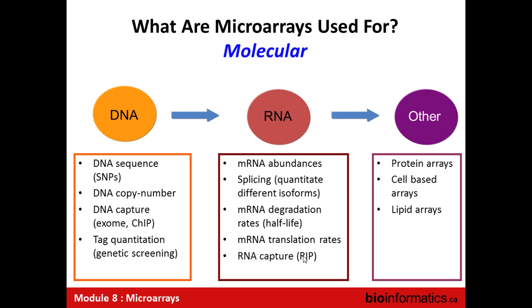Genotyping directly, and you can essentially do resequencing on an array if you really want to. Similarly, you can do copy number analysis. Genotyping arrays are frequently reused to get copy number analysis. You don't have to do anything special in terms of the genomics data generation. You just have to play with the bioinformatics. You're able to use the same array to both genotype and come up with not too bad copy number estimations. Microarrays are still widely used for some capture type experiments.